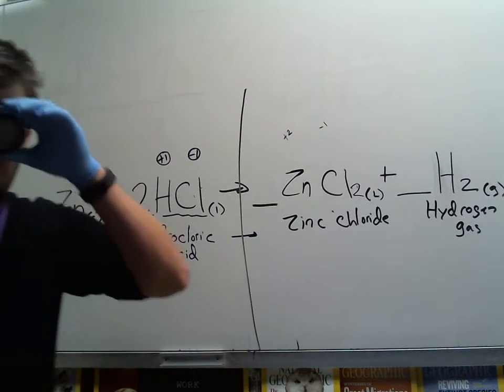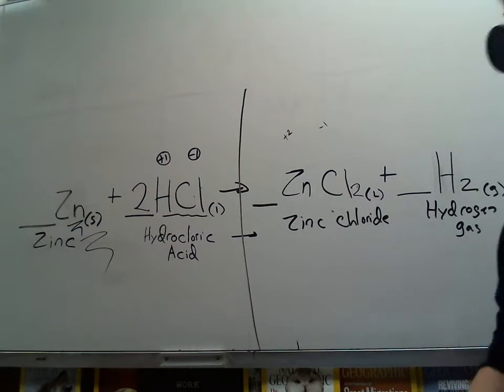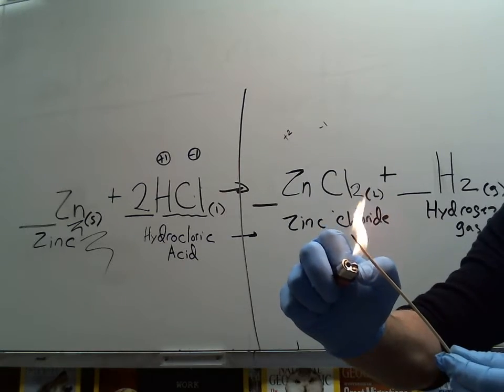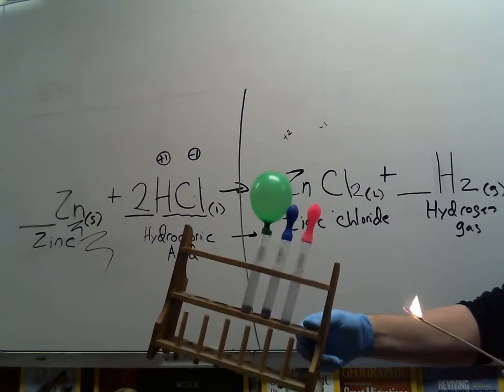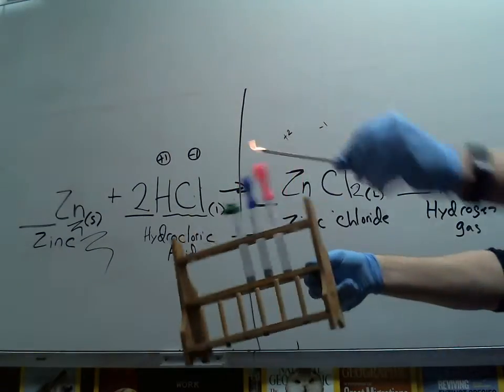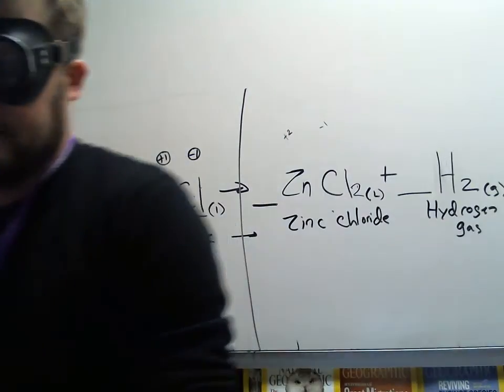And now we're ready for explosion. Hydrogen gas is flammable. So we want to test to make sure this reaction actually took place, and that's what's in there. So we light this. We now have fire. We have this, and time for pop. Boom. Yay! Science.